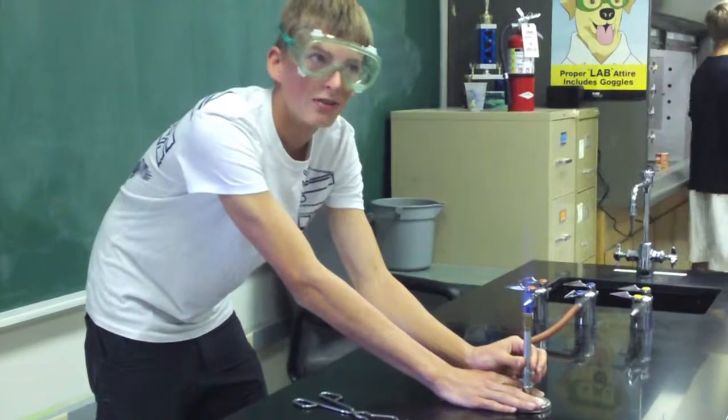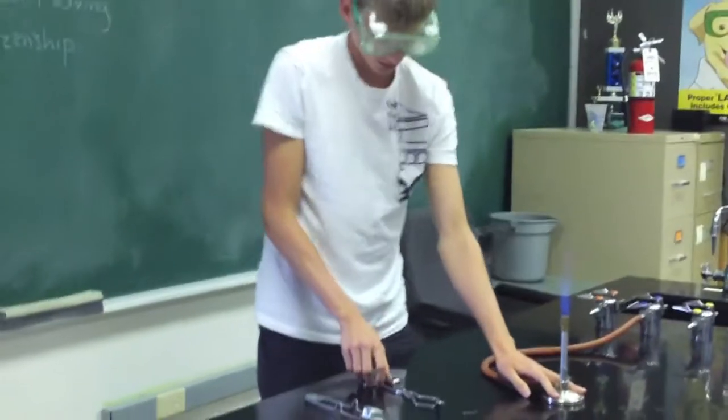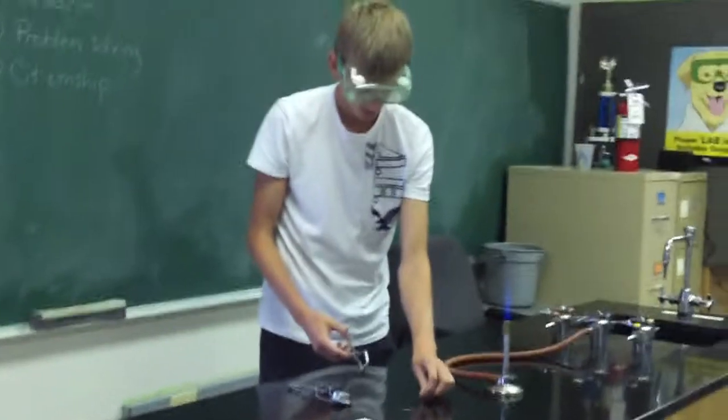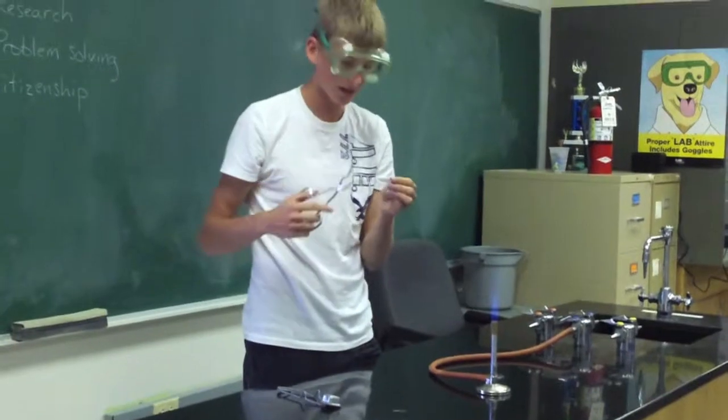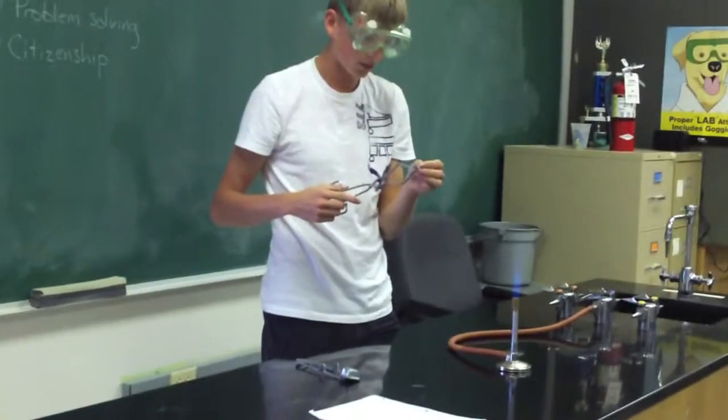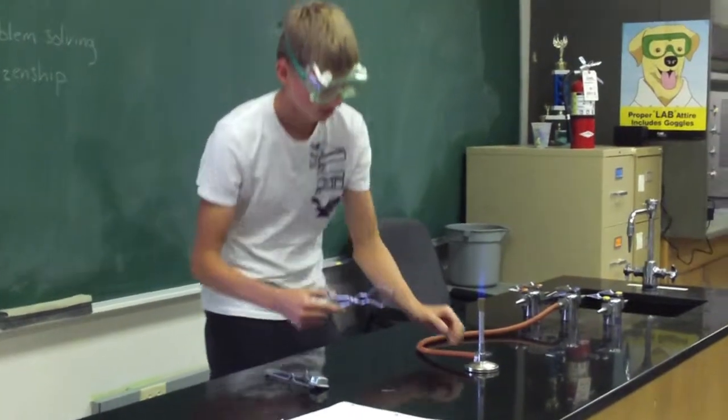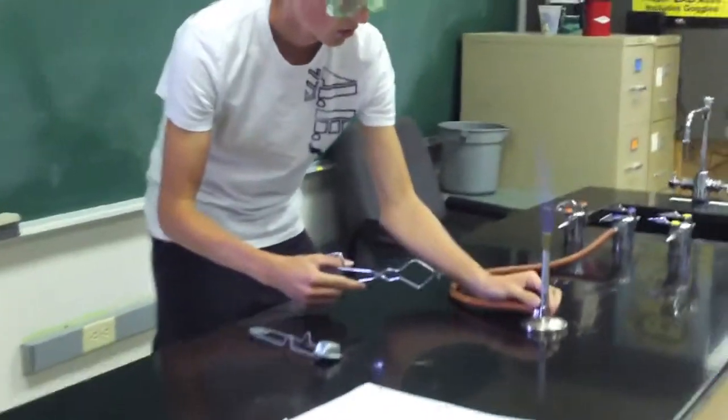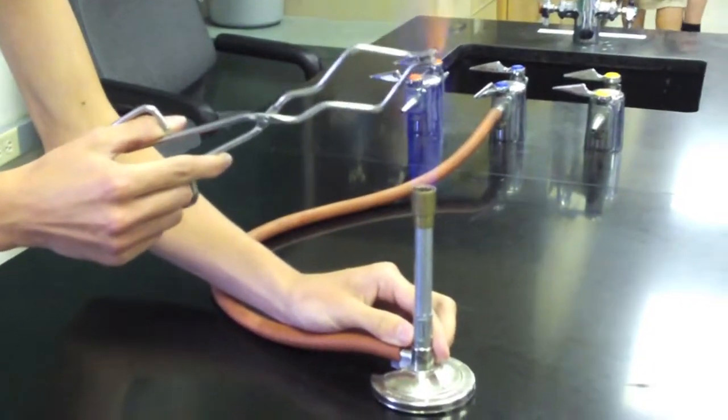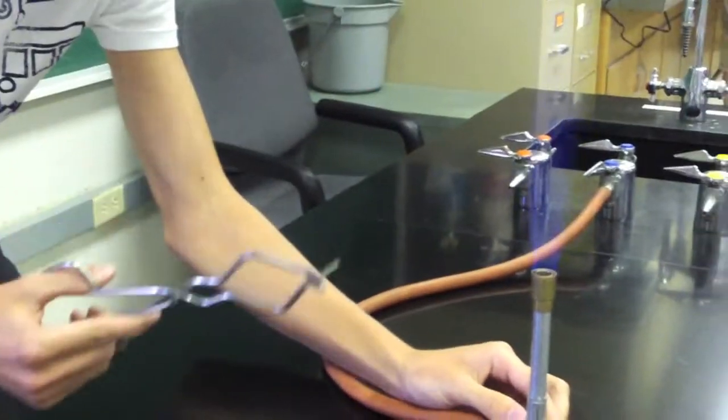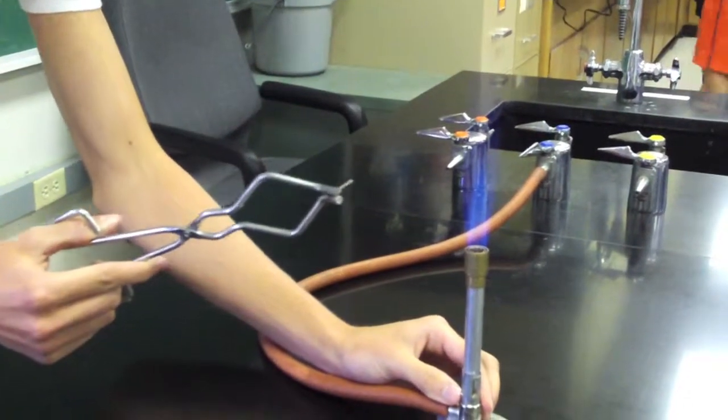Now for some fun stuff. We're going to light magnesium on fire. So this is a magnesium strip, this is forceps. Hold the forceps, and let me demonstrate the heat differences. When there's not a lot of oxygen going in, you can put the magnesium in the fire and it won't ignite. But when we open the air valves, we develop that inner cone.